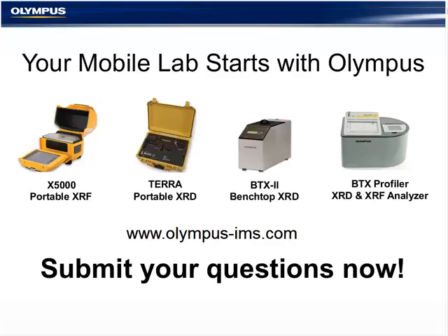On the other hand, the BTX2 is a small benchtop XRD unit. It's small and lightweight enough to be moved around, but it is not designed to be as durable and rugged as the Terra. This unit can run on outlet power and doesn't require extra cooling. The Profiler is also a small benchtop with XRD and XRF capability. It also runs on regular power. It's small and light enough to be moved quickly and easily.